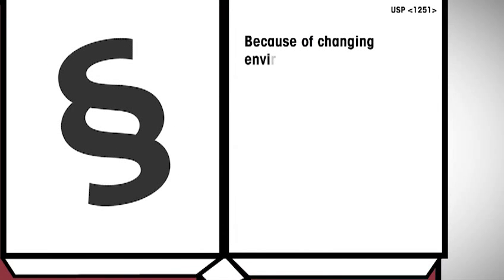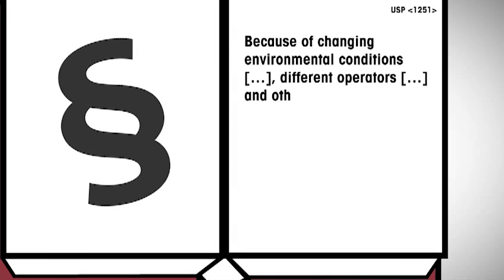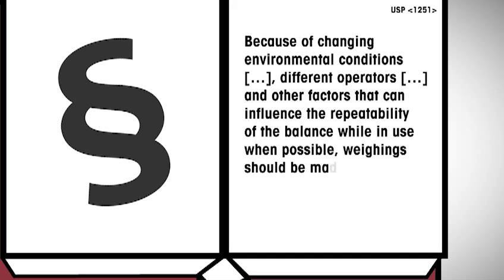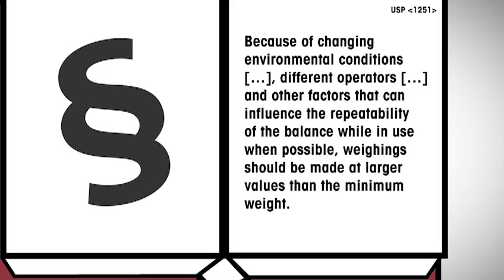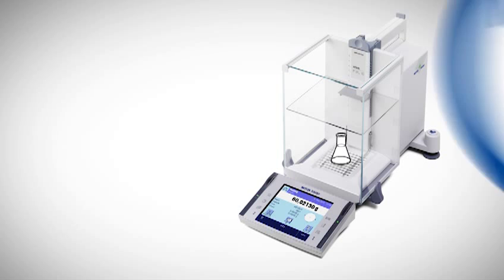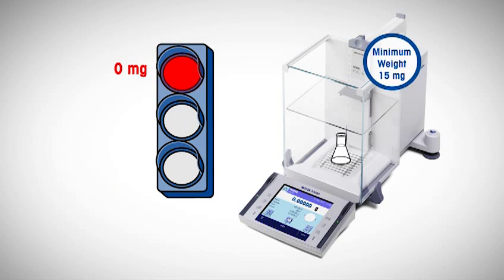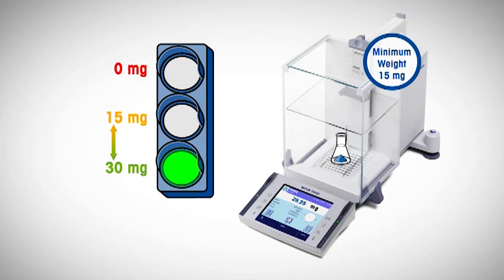Because of changing environmental conditions, different operators, and other factors that can influence the repeatability of the balance while in use, weighing should be made at larger values than the minimum weight when possible. It is therefore recommended to use a safety factor, which ensures that the smallest net weight is sufficiently larger than the minimum weight determined at a particular time by a particular person.